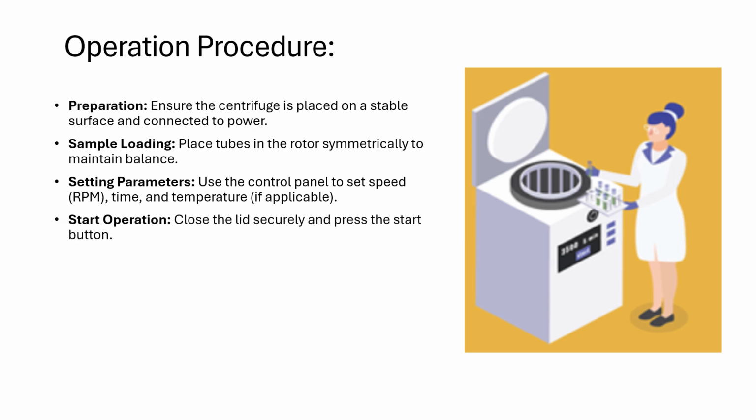Next one is the start option. Secure the lid properly to prevent accidents. That is, the lid should be closed properly. Then press the start button. Some centrifuges may require additional safety checks before initiating the spin cycle, right?